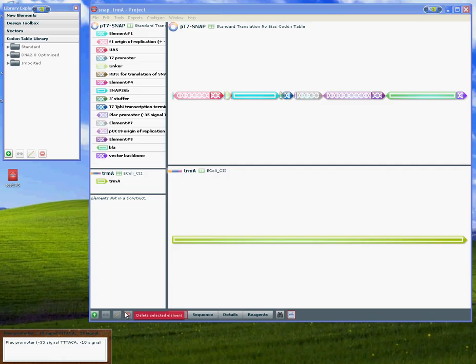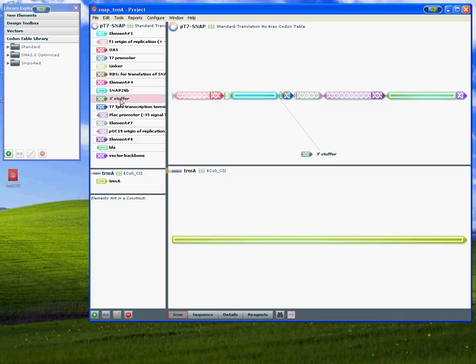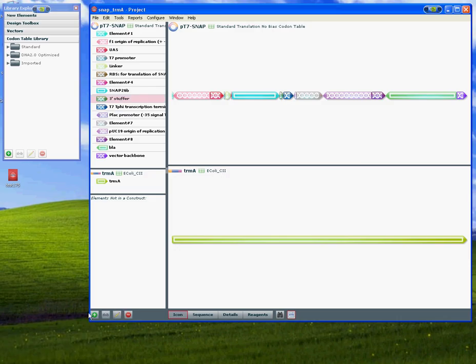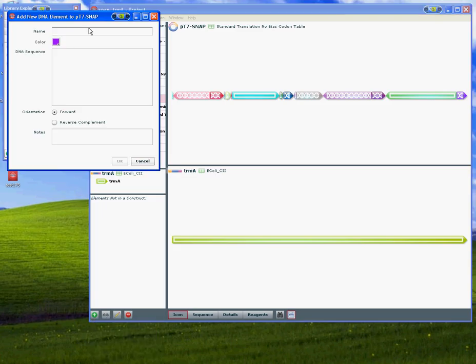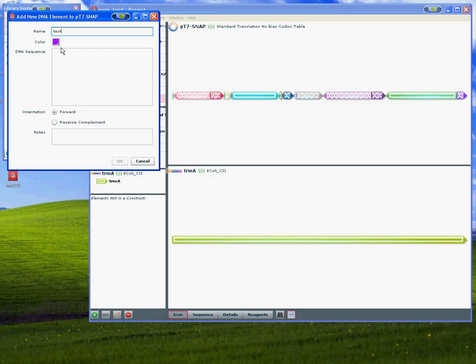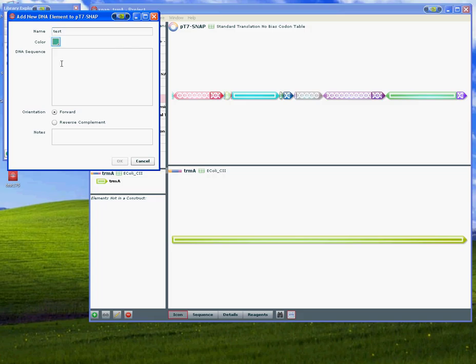So let's insert an element. Let's put it next to the 3' stuffer and add new element. Let's make that a DNA element. Give it a name, give it a color, and a sequence, and some annotation.